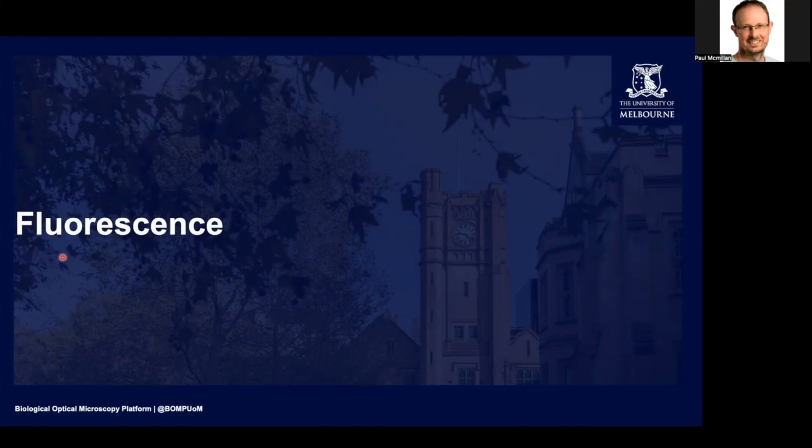So this is a fundamentals lecture. We're going to start right at the very beginning, and we're going to look at fluorescence, what it is, how it works. And throughout this fundamentals lecture series, we are not anticipating any prior understanding. So we're going to start really assuming that you have no understanding coming into these lectures.